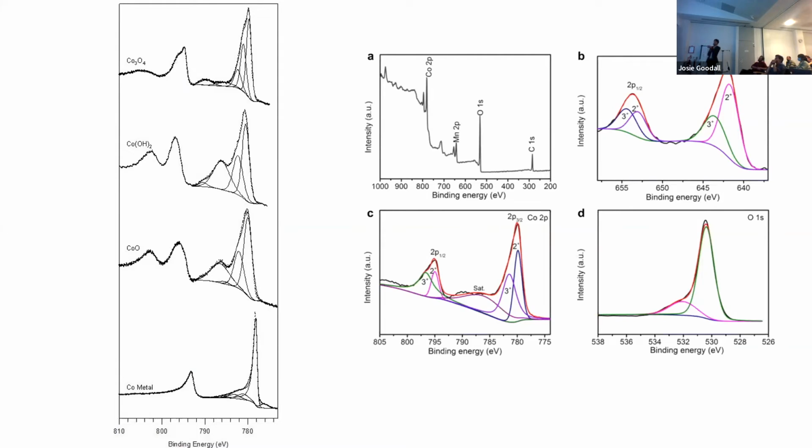So, some examples of standards here. The one on the left is one where the effort to report data is good. For example, here we have some cobalt peaks from different cobalt compounds, for example cobalt monoxide, CoO, so cobalt 2+. This is probably reasonably pure cobalt 2+. But if you look at the peak shape, it looks very complicated. If you come at this without having really worked with multiplet splitting before, you might think this is a mixture of lots of different cobalt oxidation states, and that may be what you expect for your material with cobalt. And like many transition metals, it adopts lots of oxidation states.